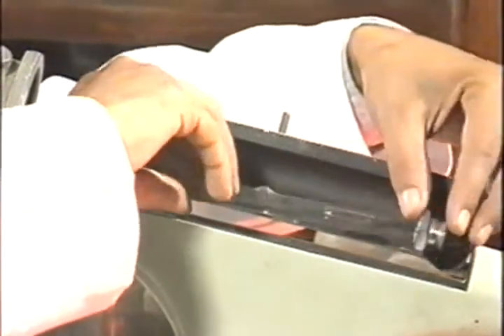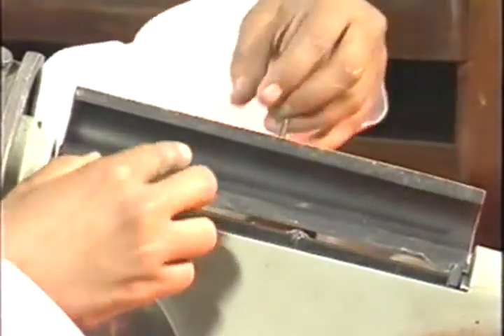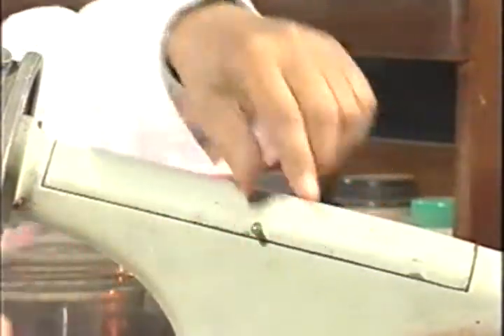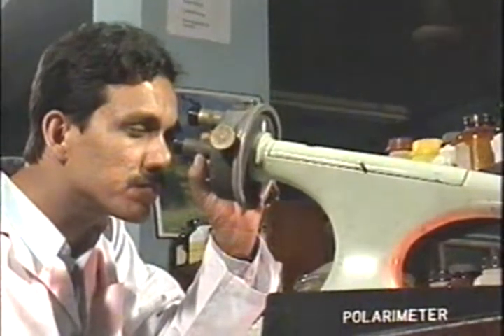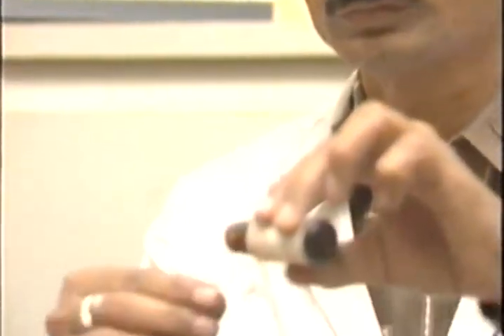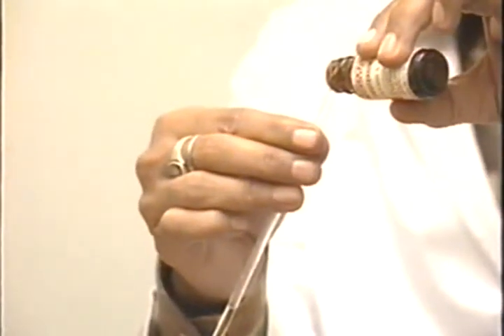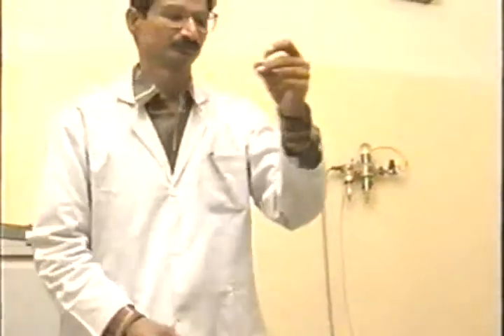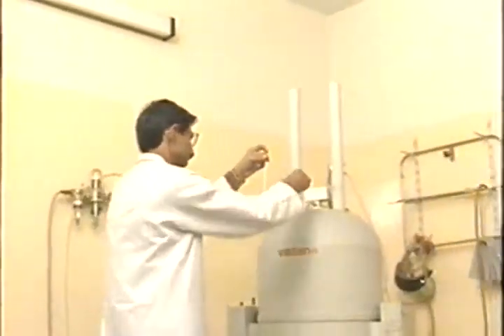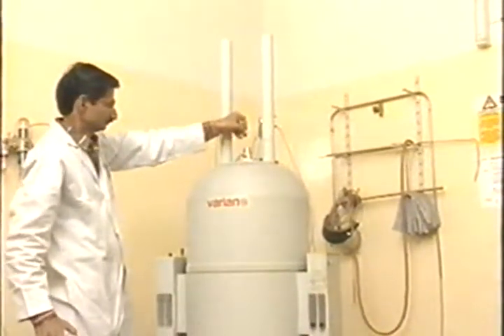Polarimeter is used for determination of sugars based on the principle of optically active carbon present in the compound and has a property to rotate the polarized light. NMR will be used for the study of structural changes and identification of homeopathic potencies, where not a single molecule of drugs is present, and science cannot explain the nature and mode of clinical action of drugs.